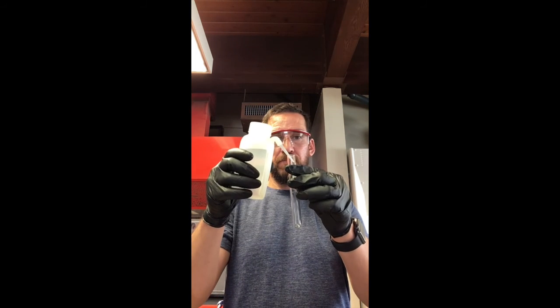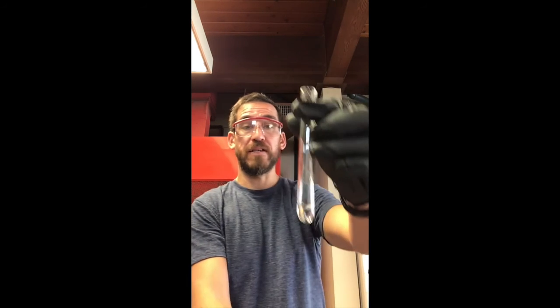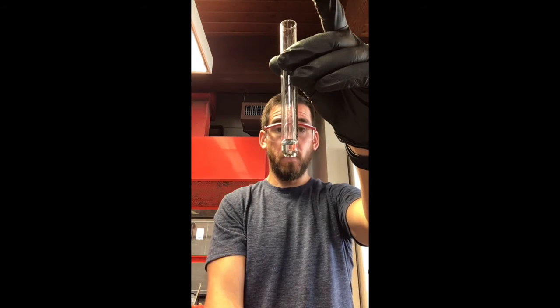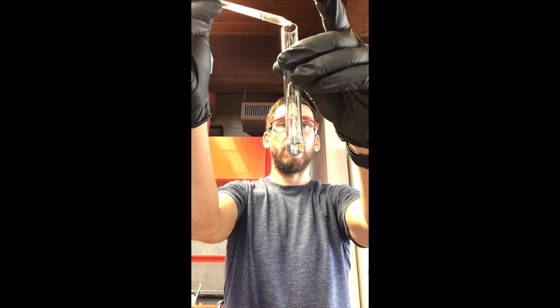I'm back, y'all. Let's check this out. So I got a test tube, and here's my little squirt bottle, DI water. Just a little bit in there, right? We don't need a lot. Now I've got unknown number 1. What we want to do is add a couple drops to this and see what happens. Does it mix? Is it miscible, or does it form 2 layers? And if it forms 2 layers, where does it go?